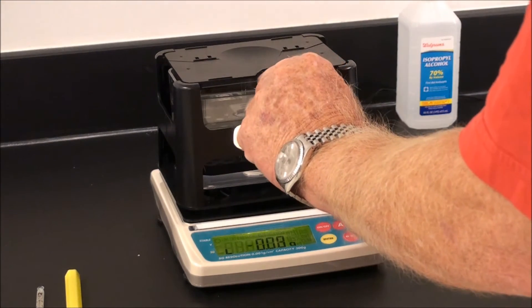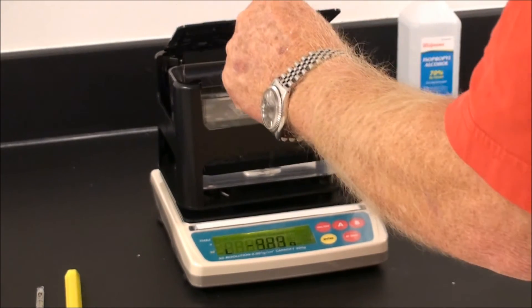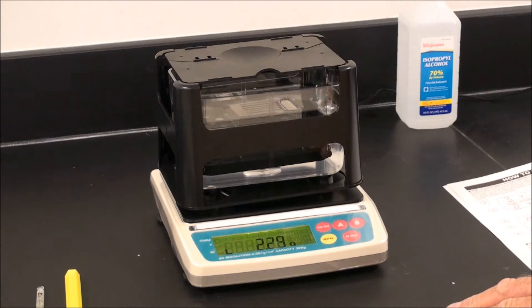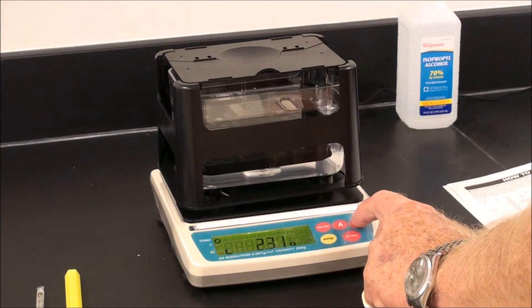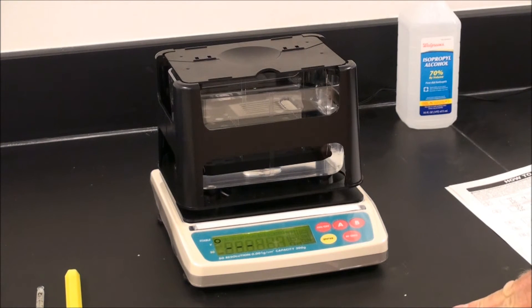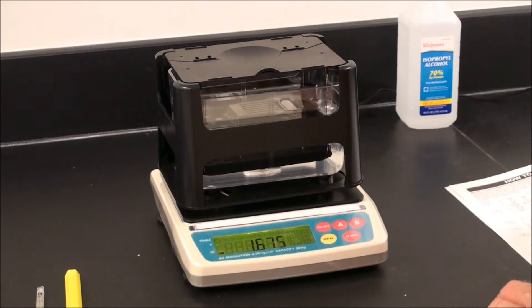Remove the sample, open the stage, and place the sample in the water. If the sample sinks, the density is greater than one and it is not necessary to use the steel weighing angle. If the sample is less than one and floats, it will be necessary to put the steel angle on top of the sample to keep it submerged. Press B gently, and then ENTER. The stability indicator will appear, and then the display will show specific gravity. The specific gravity of this sample is 1.675.